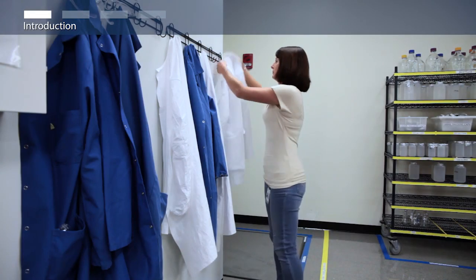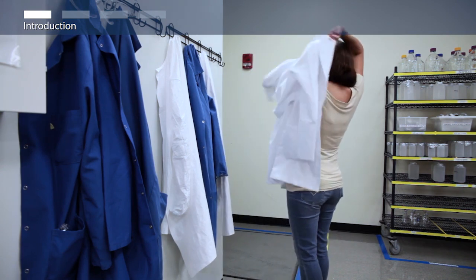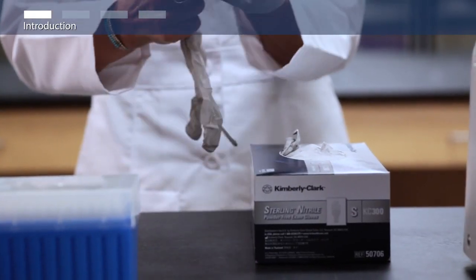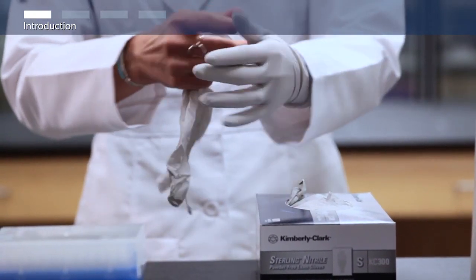In this video, you will learn how the PureLink Microbiome DNA Purification Kit allows you to isolate DNA that accurately reflects the diverse microbes in the community sampled.